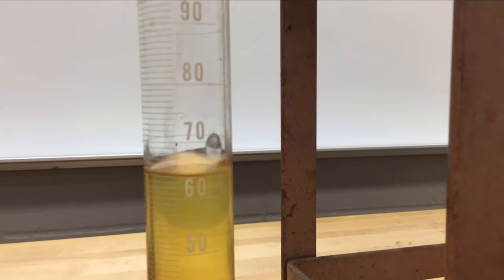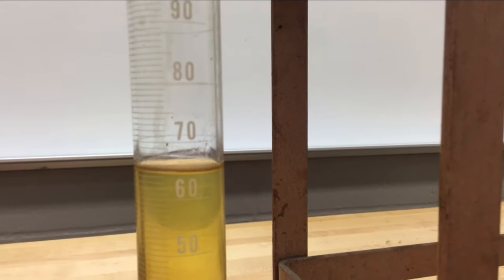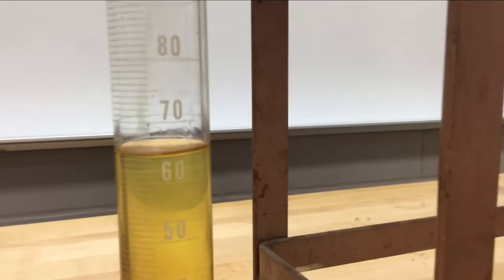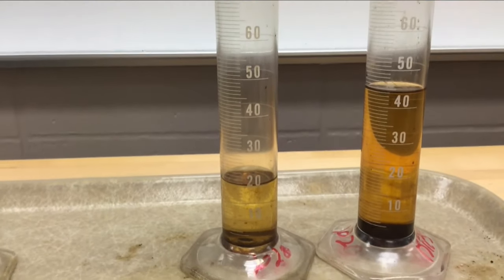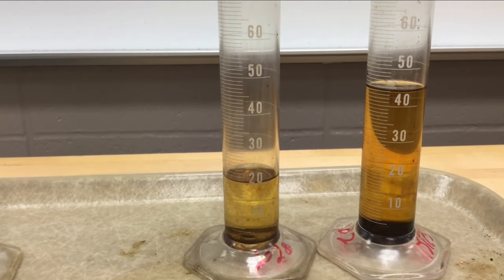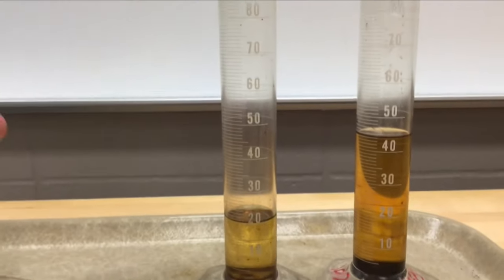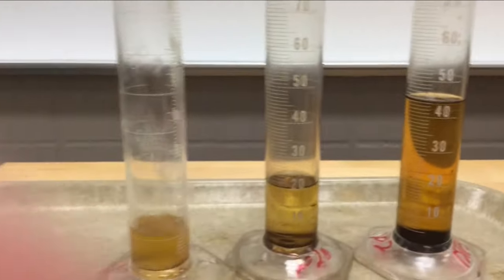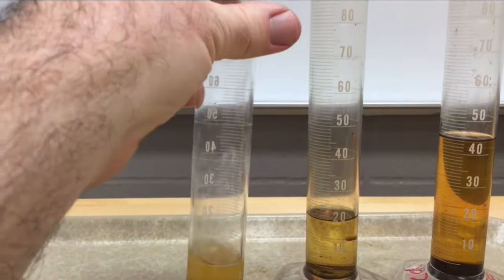That's quite a bit of diesel fuel out of there. When it's all said and done, you see it's still dripping a little bit. I did want to point out one thing to you guys, and that is if I move over to my previous sample, this is what we did last semester, and it looks like I got about 20 milliliters of gasoline and 45 milliliters of diesel fuel. You can compare that to the sample that we just did today, where I only have 10. Why is the difference there? Why did I only get 10?